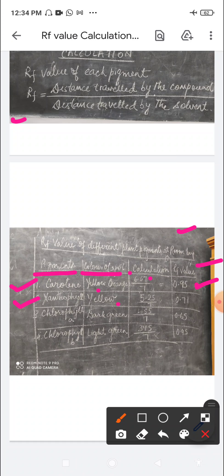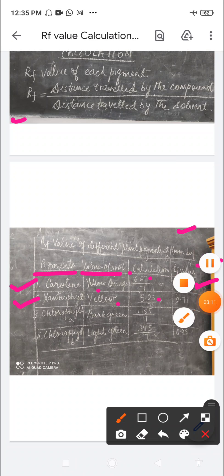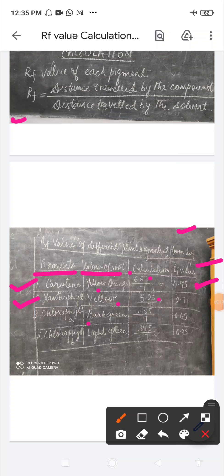The second position is yellow in color, which is xanthophyll. The distance traveled by this pigment from the loading spot is 5.25, and when we divide by seven the RF value is 0.71. The third position is dark green, which is chlorophyll a. The distance traveled by chlorophyll a from the loading point is 4.55, divided by 7, giving an RF value of 0.65.